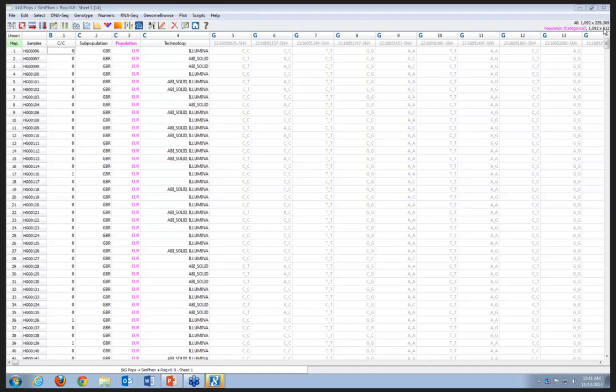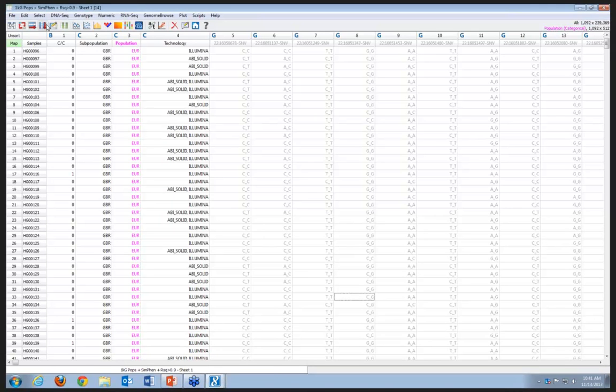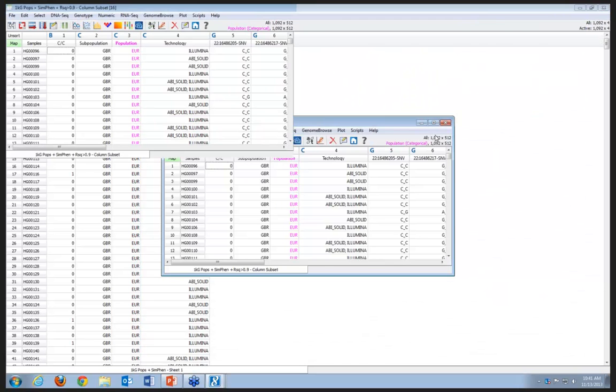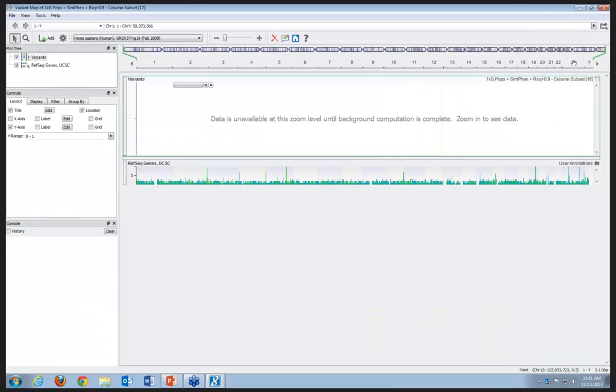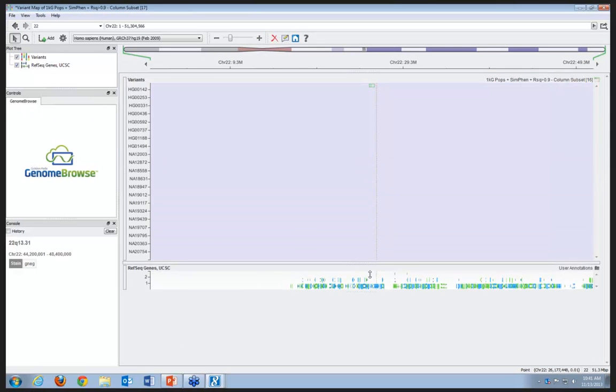We see that our function finished up, and we also see that there are only 512 columns that remain active. And so I can subset this, and what I should find now is these remaining columns are all going to be variants that fit that pattern I was looking for, at least 50 of the Europeans being carriers, pretty good frequency in Africans, lower frequencies in the other groups. To visually capture that, let's just go ahead and bring this into the browser.